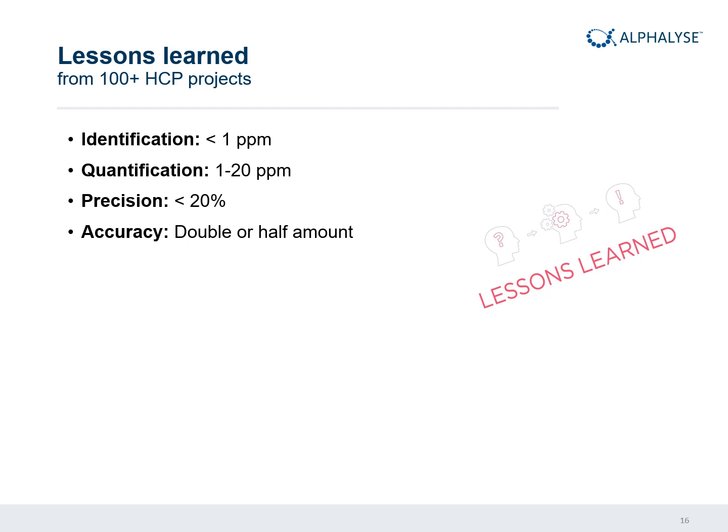But remember, we have the criterion that we need at least 2 peptides pointing at any given host cell protein before we say we can quantify it. The precision is typically below 10%. We say, to be certain, that it's below 20. That means if you compare results from different analyses for a specific host cell protein, you can easily compare the quantities from one sample to another.